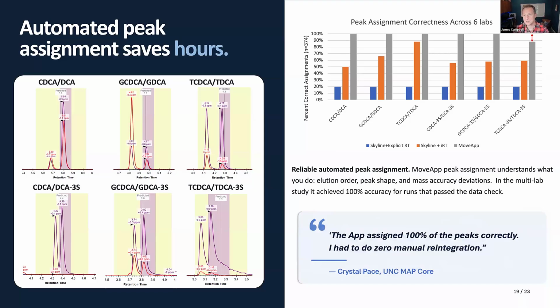And in cases where we identified a data check failure, meaning what I was referring to earlier, where we identified early that resolution would be impossible, we missed those small number of cases, as I think is necessary. In all other cases, we were able to correctly label all of the critical pairs and all of the broader analyte set coverage that's part of the panel.